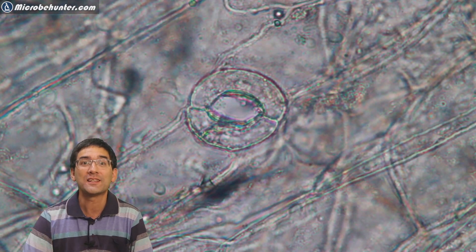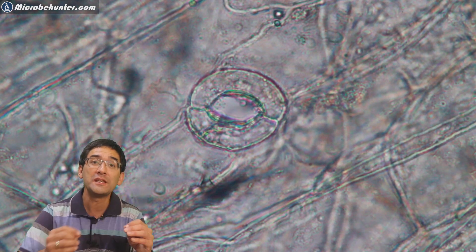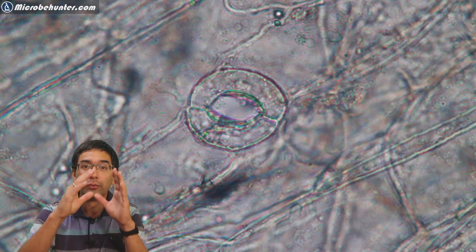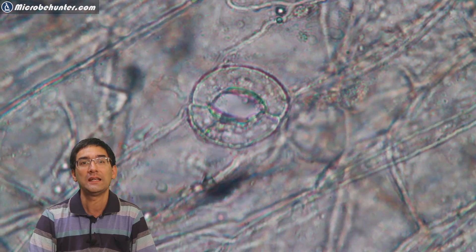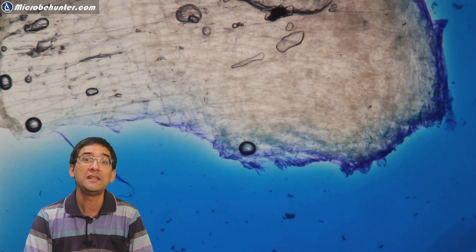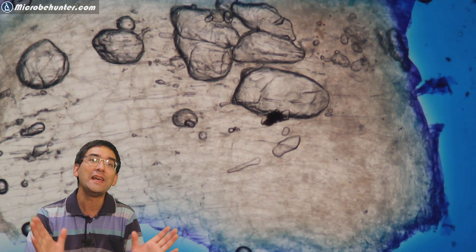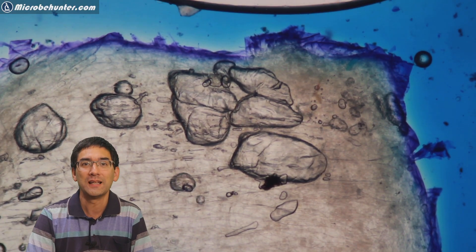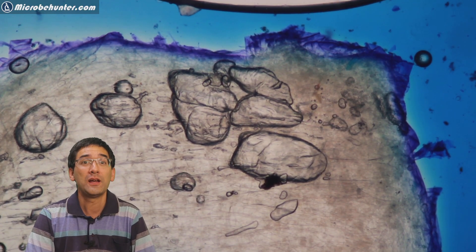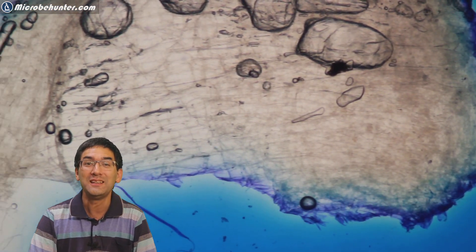Stomates allow for gas exchange because leaves do photosynthesis. Carbon dioxide from the air is able to go into the leaf through those little openings. These are called stomates. Here I see the blue methylene blue which nicely stains the edges of the salad. I was quite interested in finding more of these stomates, and indeed I was successful - there were quite a few of them on the leaf.